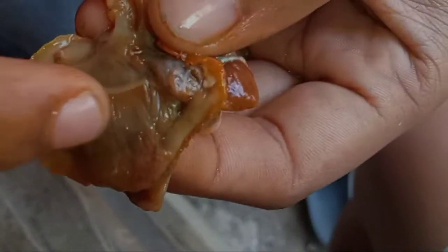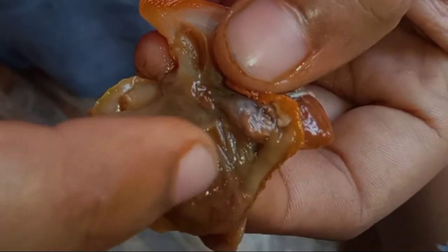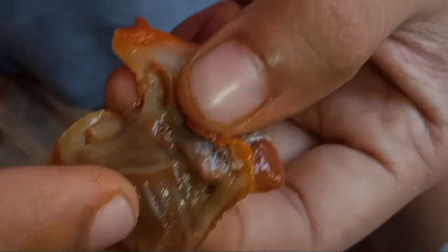This part is the gills. They are large leaf-like organs that are used partly for respiration and partly for filtering food from the water. Two pairs of gills are located on each side of the body. At the anterior end, two pairs of flaps, termed labial palps, surround the mouth and direct food into the mouth.